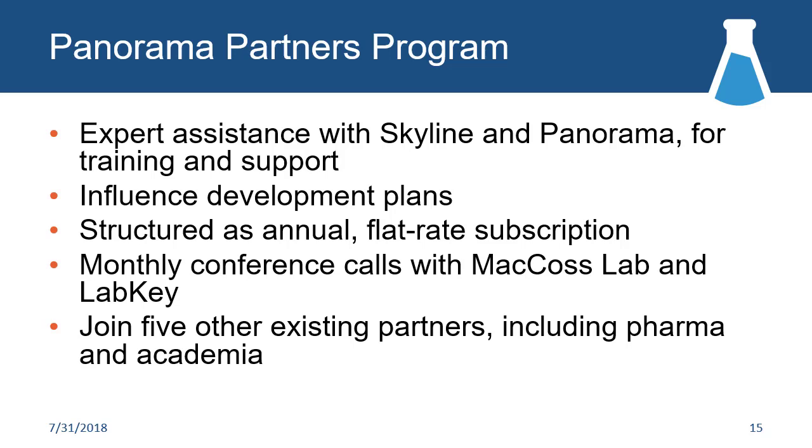But this gives you a little extra boost in terms of setting those priorities. And really, a lot of the organizations that have joined Panorama Partners have been companies that want to have their own in-house installation and want to have assistance in running that, making sure it's maintained and upgraded and so forth. So there's a number of pharma companies where we're actively collaborating, and they've contributed a bunch of the ideas for the new features that we've added since the initial rollout.